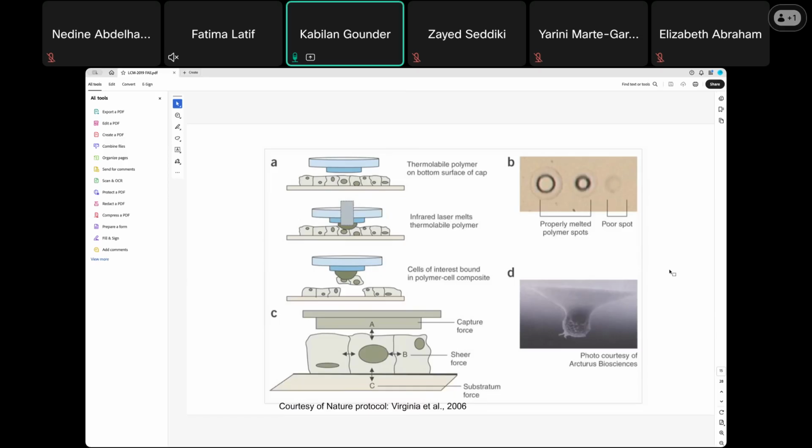Good afternoon. So, last class we discussed laser capture microdissection. So far we thought that microscopy helps us visualize the structure of any samples. But with laser capture microdissection, we are not only going to see the structure of the samples, but also isolate the cells which you want. So, why do you want to use this protocol or this technique?